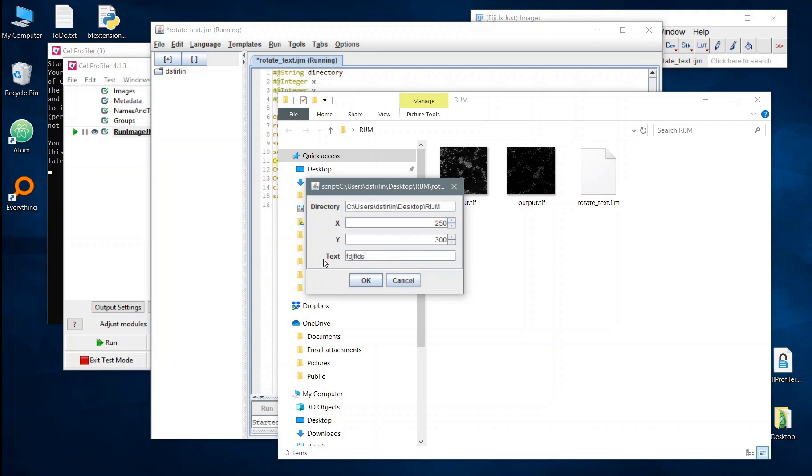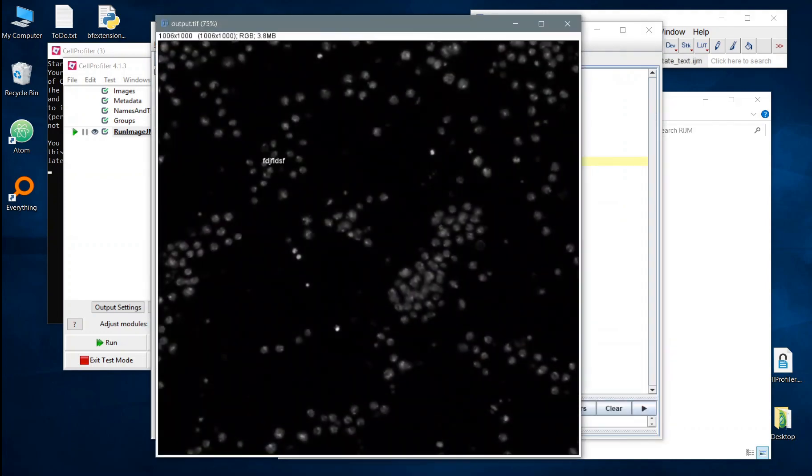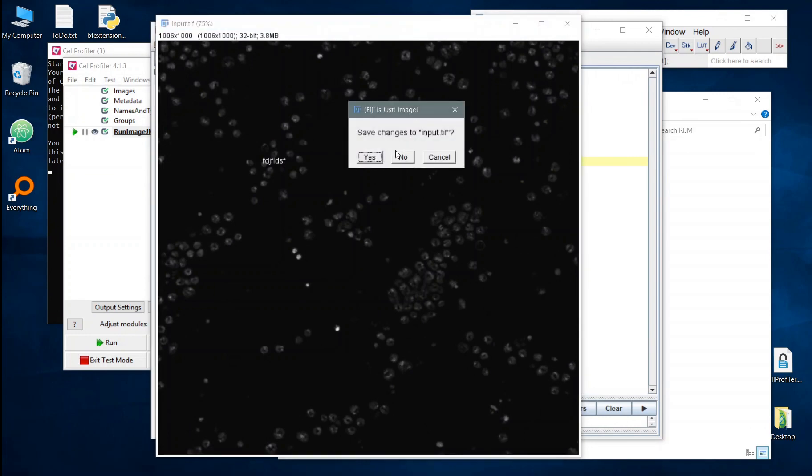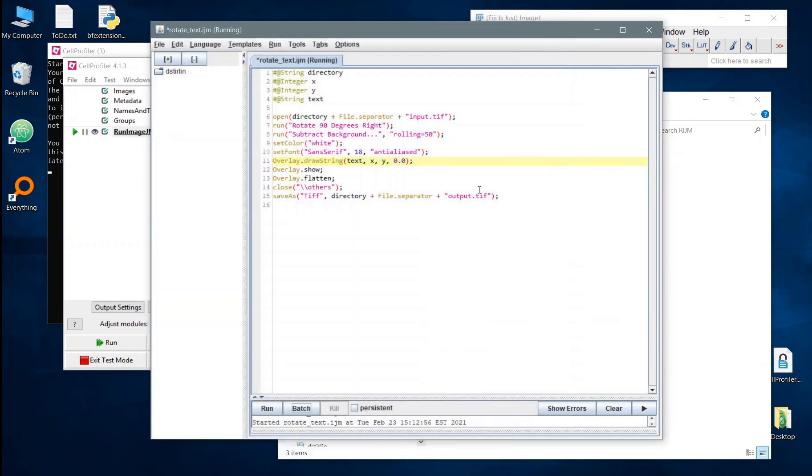So yeah, we can call the text whatever we want. And you can see it's placed it now where we want to. So let's be sure to save that now.